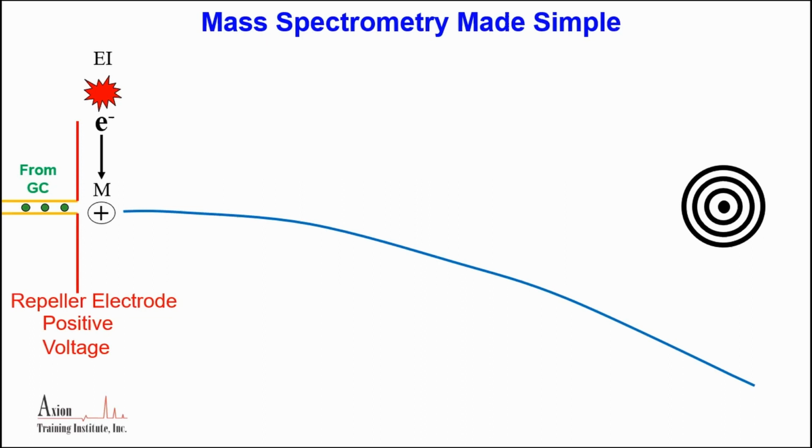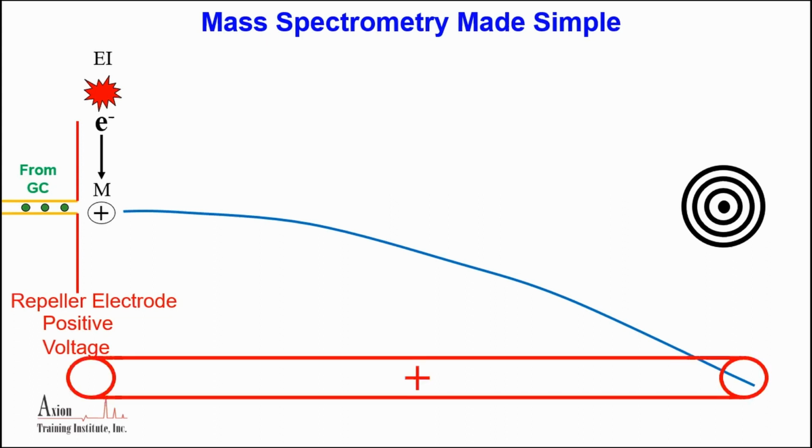So how can I then use this to weigh the molecule? Well, let's put an electrode in there, or a magnet. We'll put it down there at the bottom, and we're going to make it positively charged, or the north pole of the magnet. And we're going to set it to whatever the exact force is that gravity is pulling down, we're going to push up. So imagine this molecule, this blue trace here.